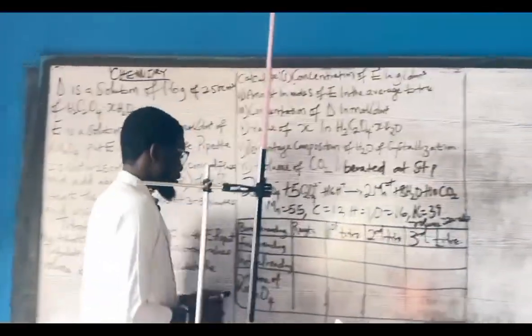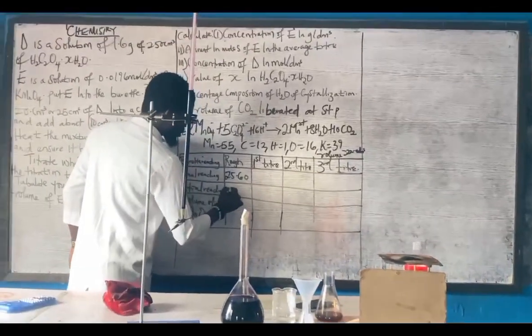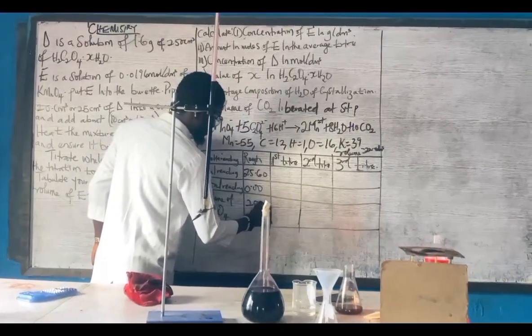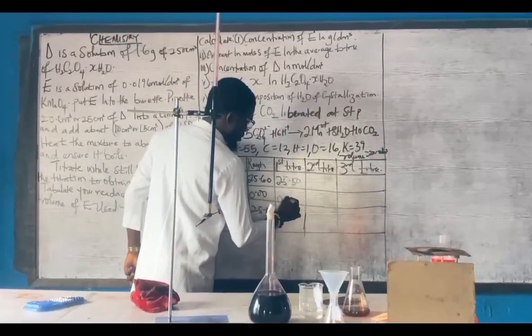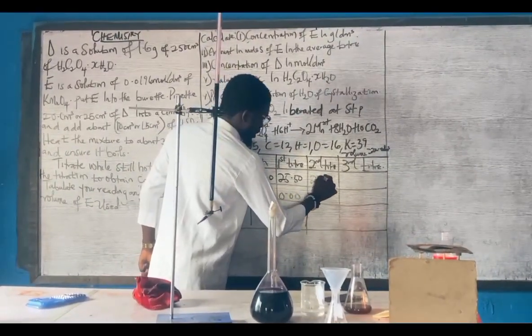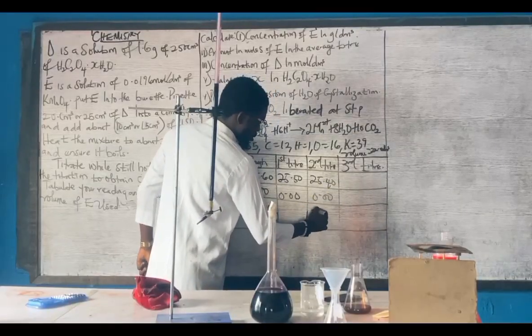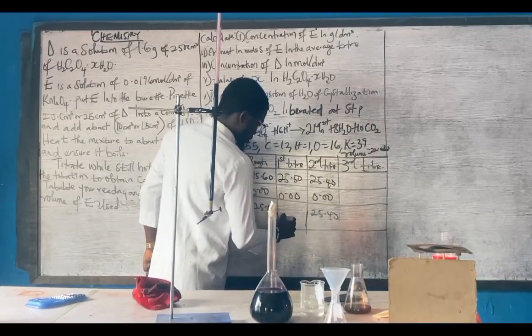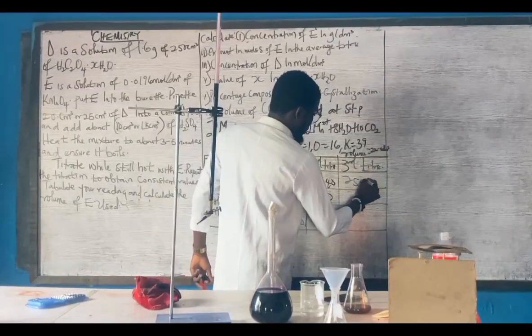So we have 25.60. So this will be 25.50, 25.40, 25.50, and here we have 25.50.